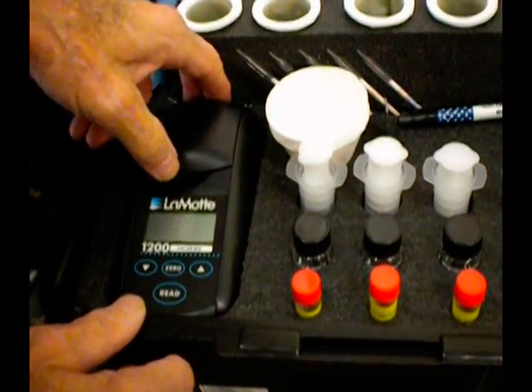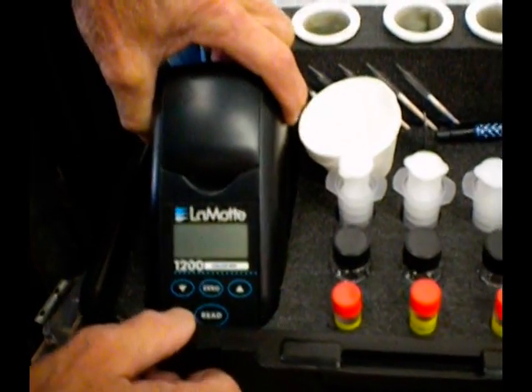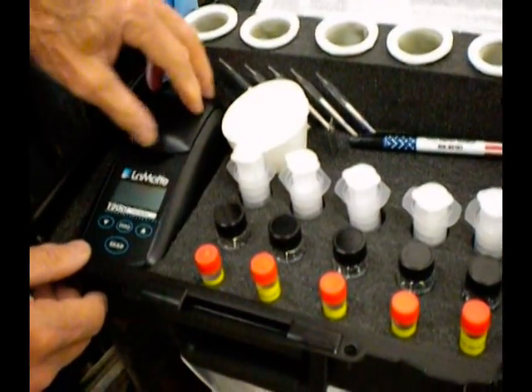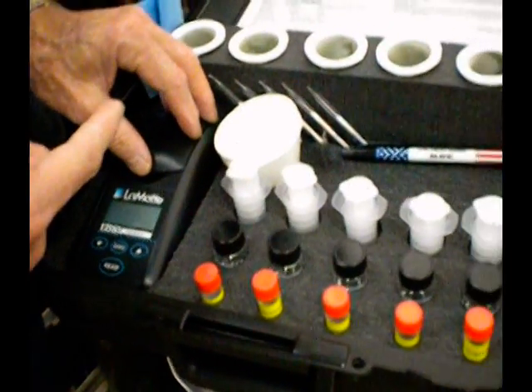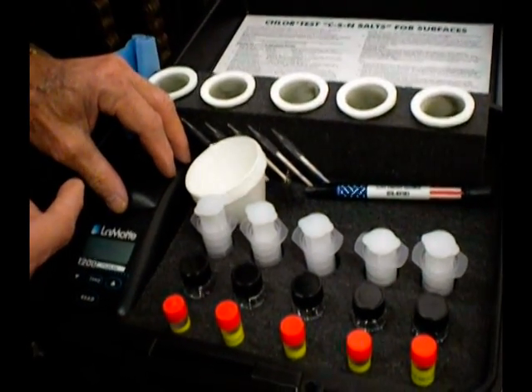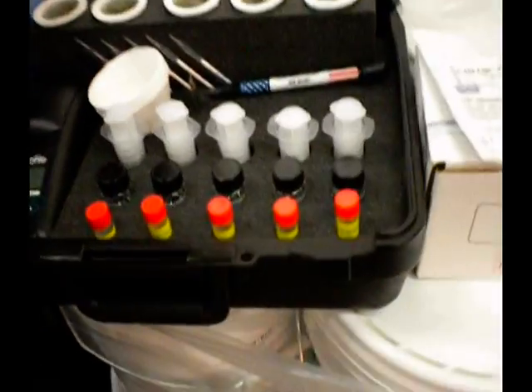This is the meter that's used to measure the sulfates. What it actually is, is an electronic eye that looks through the bottle and measures the opacity of the solution. If you've got dirty fingerprints on there, it can affect that reading, so we provide the wipes to deal with that.